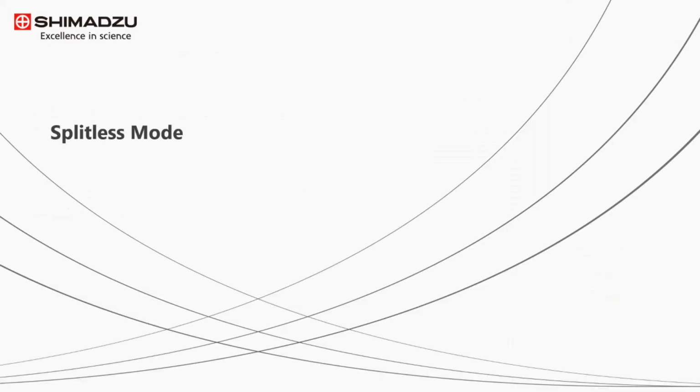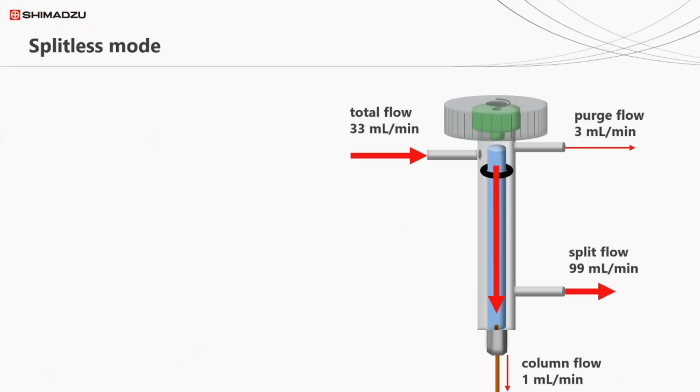As it happens, adding a split line is not the only way to maintain peak shape. We can actually work without one, in a different work mode called, yes, you guessed it, Splitless. Now, fear not, everything I said in the previous slides about needing a split line is true, most of the time. But there are occasions where we can get away without needing one.